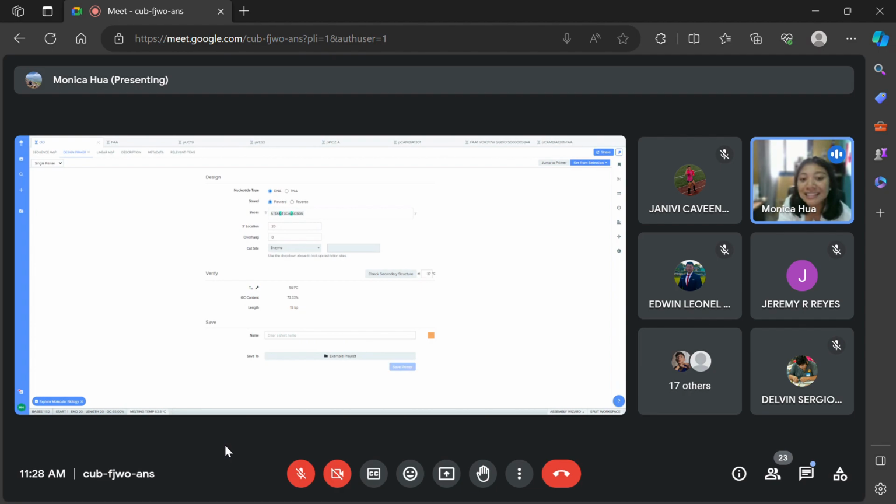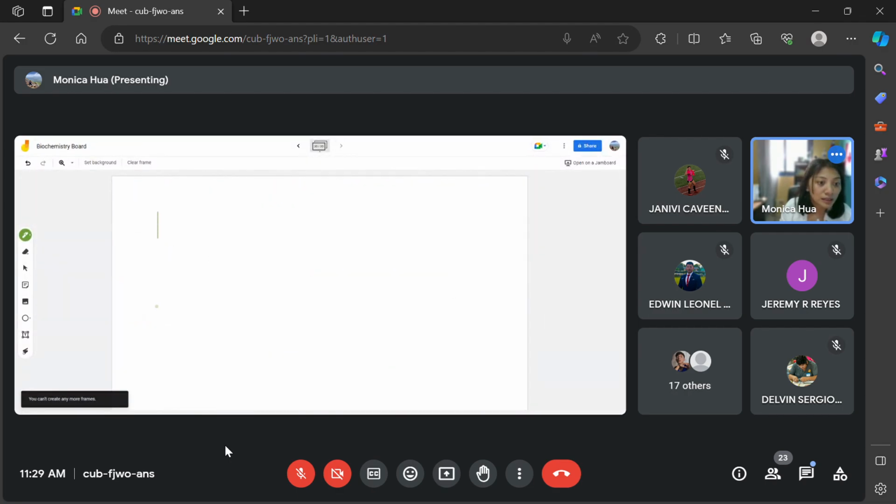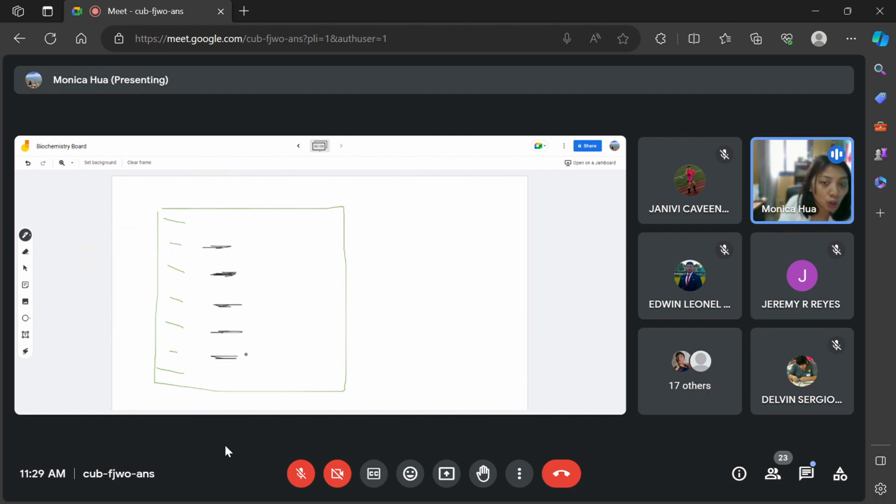So you still try your best. If it captures other sequences, and we'll discuss this after PCR, what you will do is, if I could draw a DNA gel, on your gel you have your ladders, right? And what's going to happen is you might have the product that you want, but you might also have other sequences along with it. And it makes it a bit difficult for you to get a pure product. In that case, it's fine.